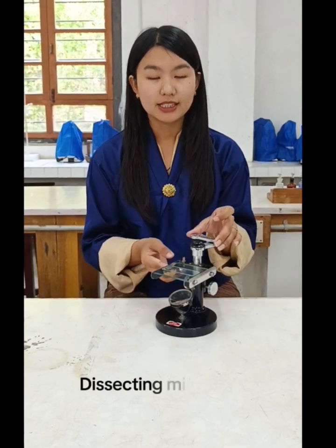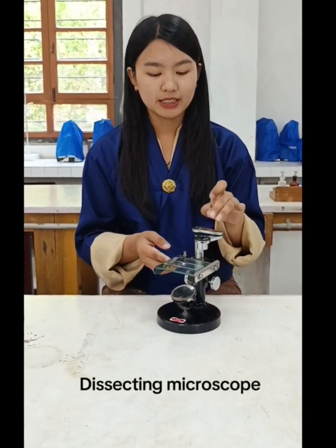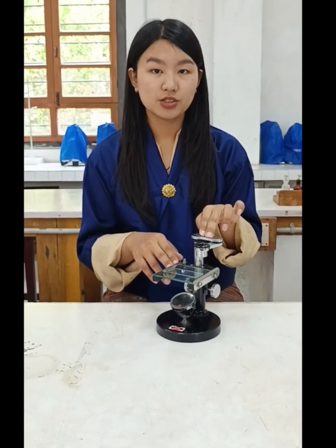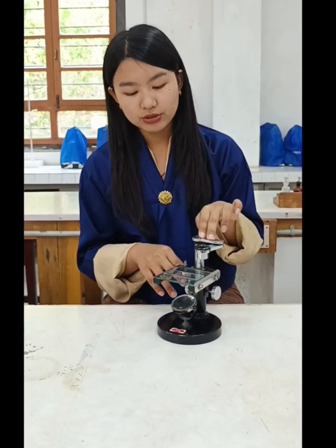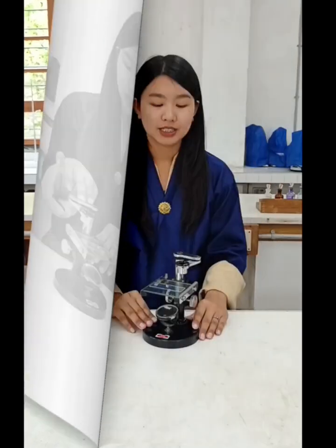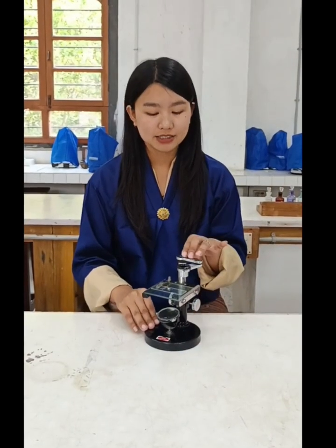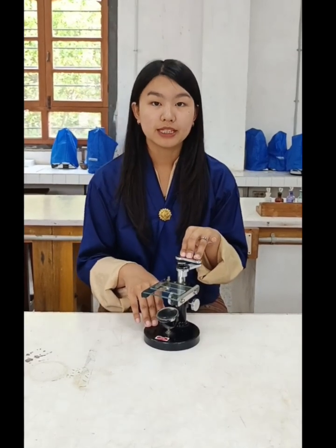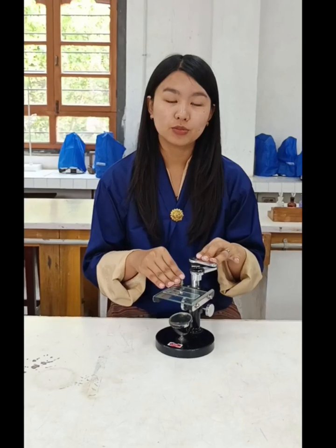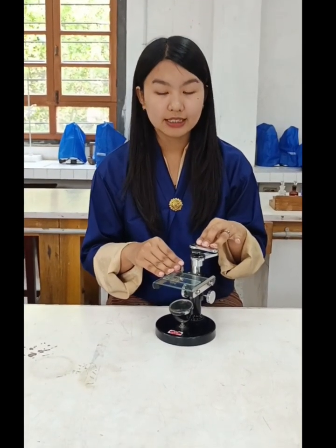Now I will talk about the dissecting microscope. This is the dissecting microscope and it is light illuminated. The image that appears is three-dimensional. We cannot see individual cells because it has low magnification. Some specimens are larger, so we do not have to magnify much. In this case, we can use the dissecting microscope to get a better look at larger specimens.